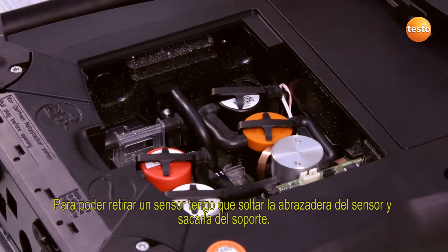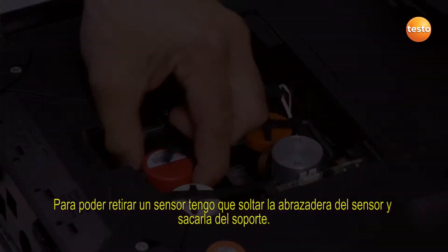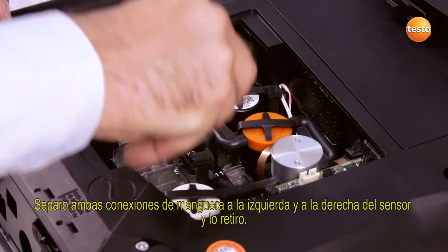In order to remove the sensor, I have to release the clip over the sensor and remove it from its fittings. I disconnect both hoses on the left and right of the sensor and remove the sensor.